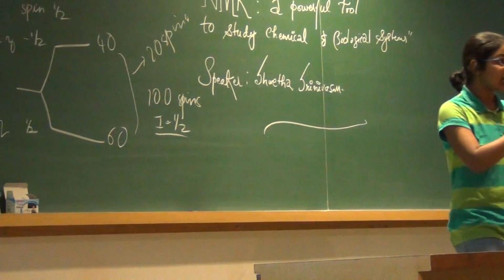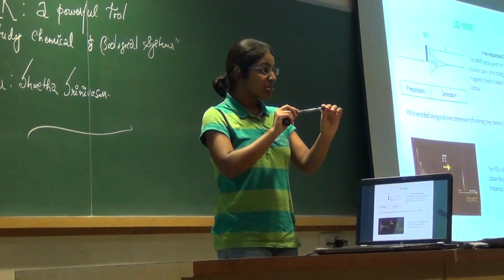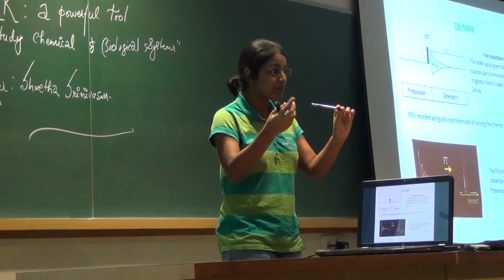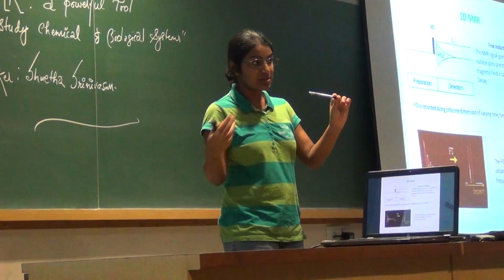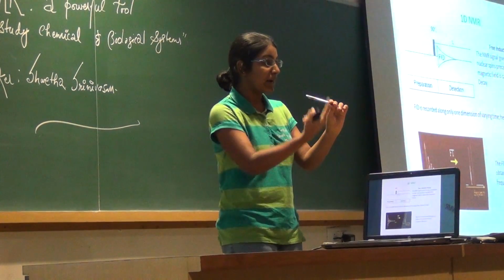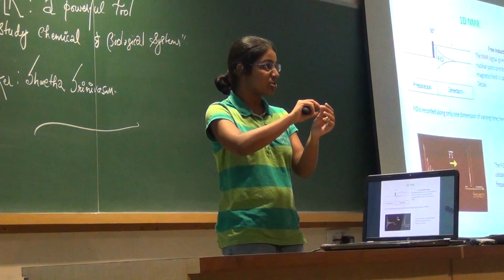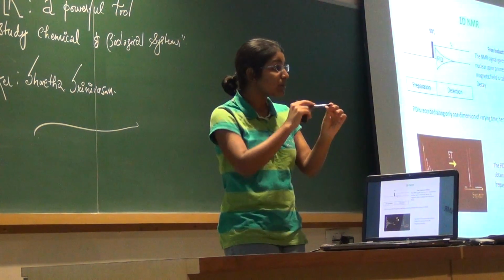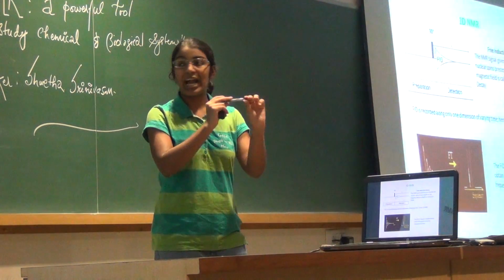So now I've applied this RF pulse. Initially my magnetization was along Z, and I've dropped it to Y. Now the RF pulse is removed. This RF pulse is a magnetic field applied about the X, and the RF field is removed. So now there's again this bulk magnetization. What is the property of these nuclei? They start precessing about that bulk magnetization. When it precesses, what is the frequency with which it's precessing? The Larmor frequency. It is this Larmor frequency which we catch in our spectrum.